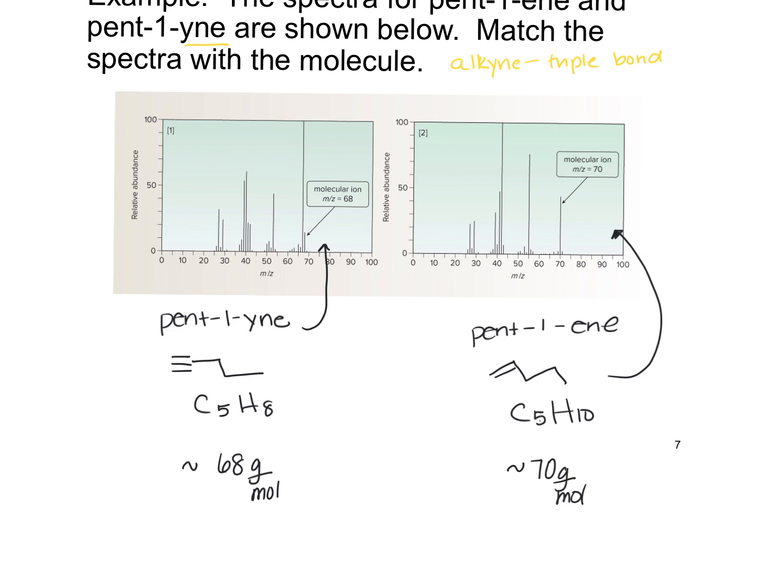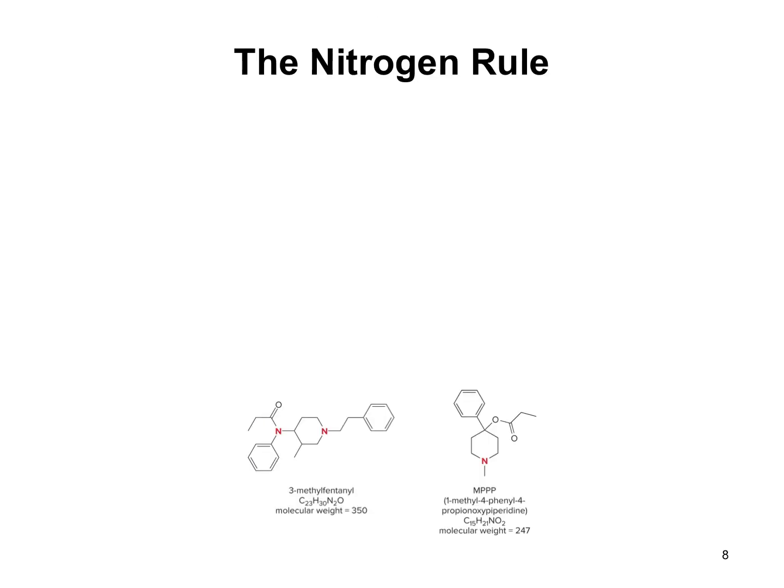Now, maybe the burning question in your heart is, Dr. Pierce, we have looked at things with just carbon and hydrogen. What happens when you throw in oxygen and nitrogen and halogens? And I'm so glad you asked that. So let's talk about nitrogen first.